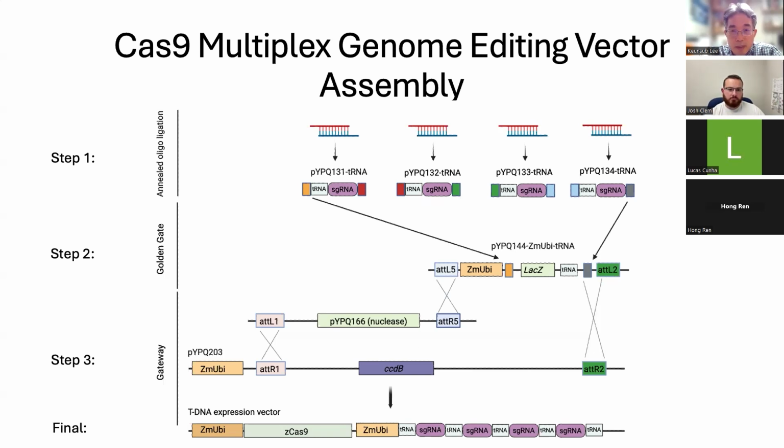Oh, okay. Yeah, they tested, with the NOS terminator as the control, and they compared the 35S terminator and the chimeric terminators plus matrix attachment region, or MAR. So if you really need a higher expression, you can consider those terminators. However, it was validated in Benthamiana, so it doesn't mean it'll work equally well in your own species of interest.